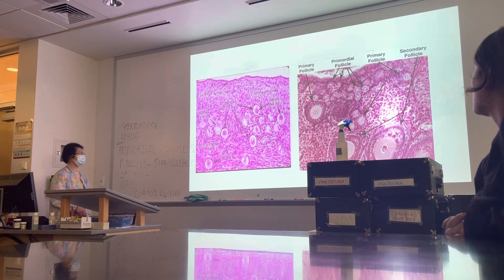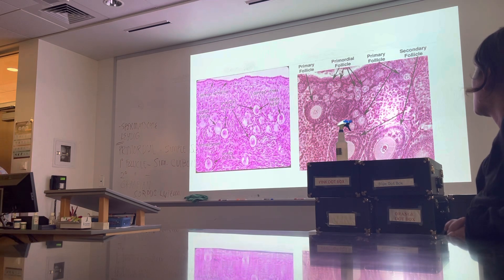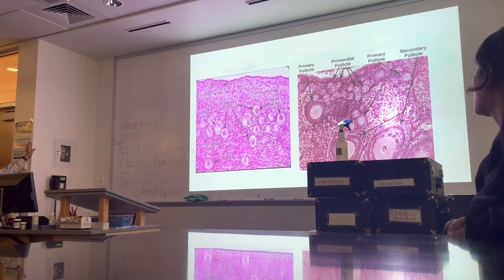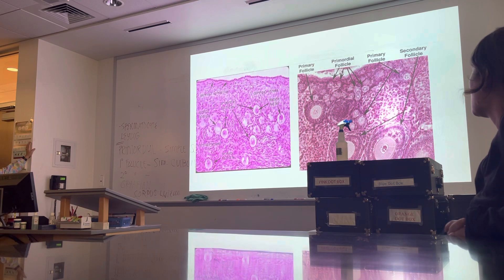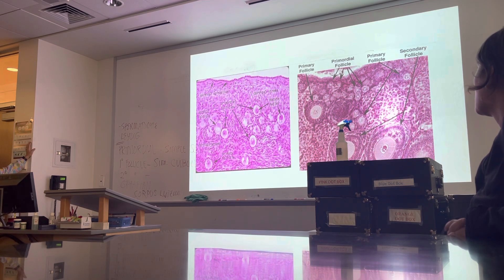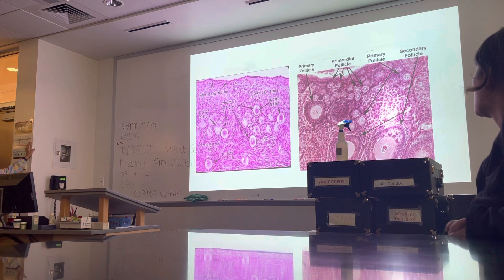You're going to get a slide of the ovary. You have to identify a primordial follicle for me. How do you know you're looking at a primordial follicle? If you see the follicle cells as simple squamous epithelium. This is a primary follicle because the follicle cells become cuboidal. Look at the secondary follicle — there are several layers of cuboidal cells plus there's fluid separating them. That's a secondary follicle. There are a ton of primordial follicles, especially if you have a young ovary.